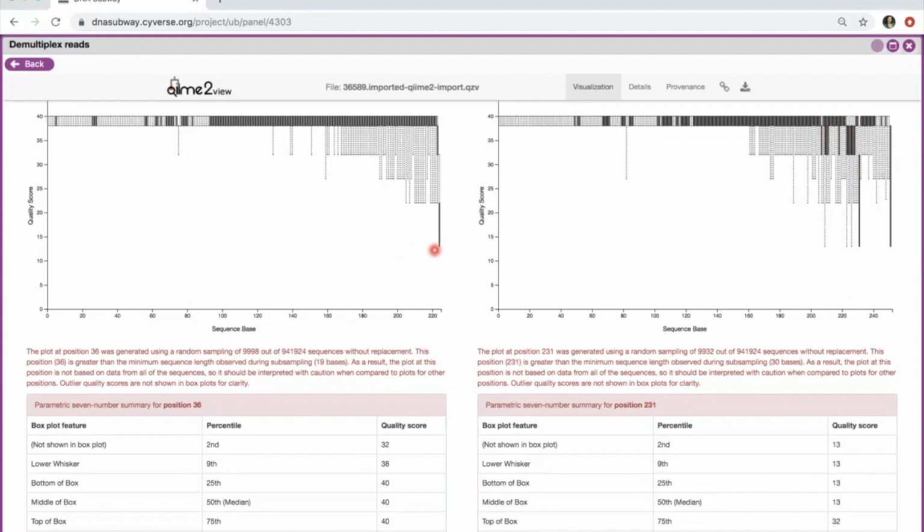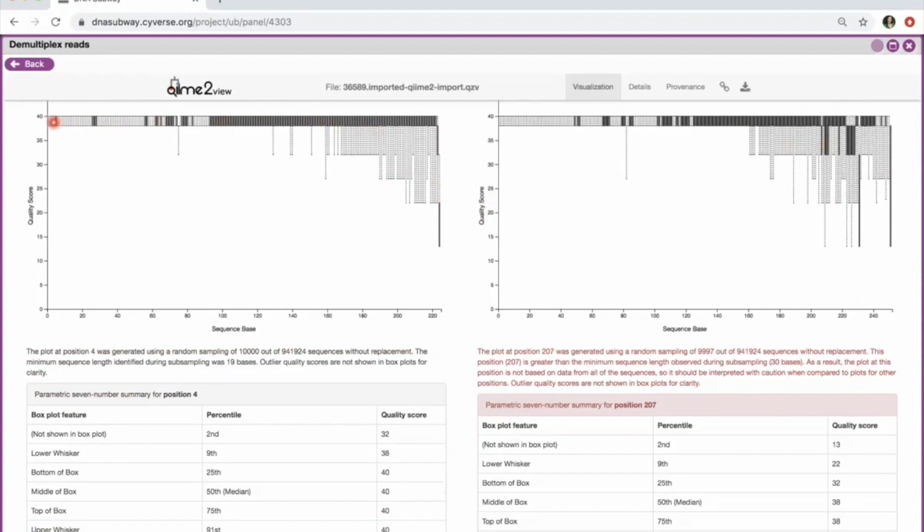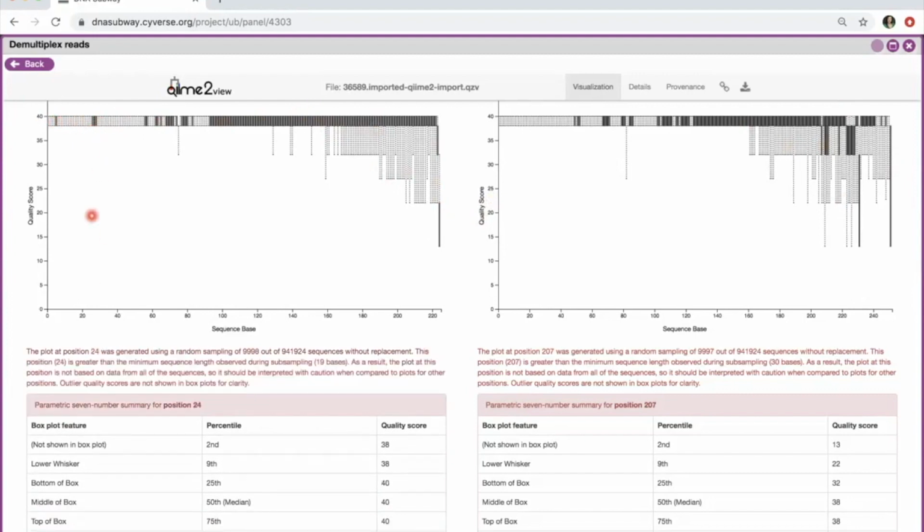Now, one thing about this selection process is that it is a kind of recommendation. Your data most certainly will not look like the data that you see, like my data. Every sequencing run is different. And it's possible that you will see nucleotide bases drop really, really early on. It's possible that within the first 100 bases, you might have 1 or 2 or even 3 positions that are really, really low, and then they go back up again and they're high.